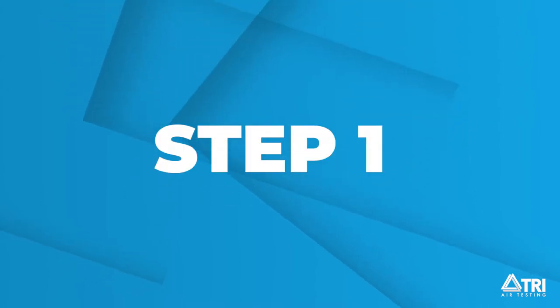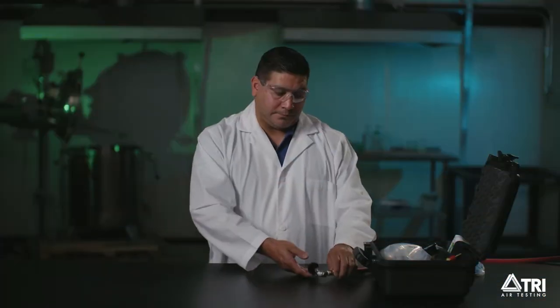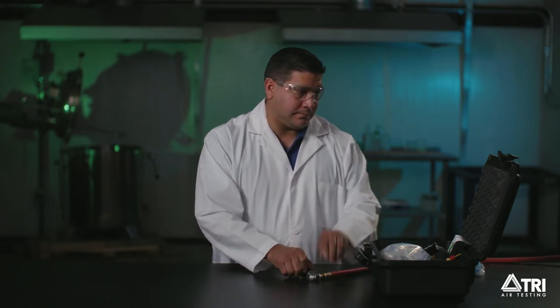Step 1. It's important to note that you must have a system line pressure of at least 20 psi to use this equipment. Allow your compressor to run with air flowing for at least five minutes before sampling.